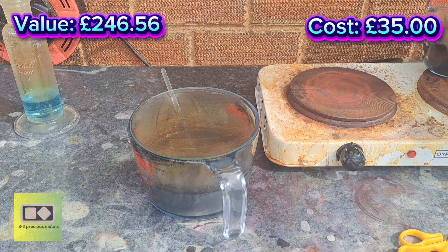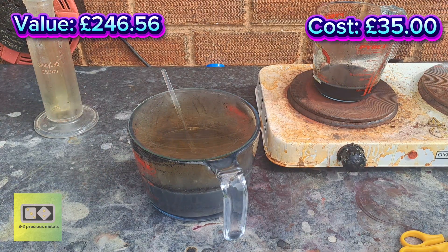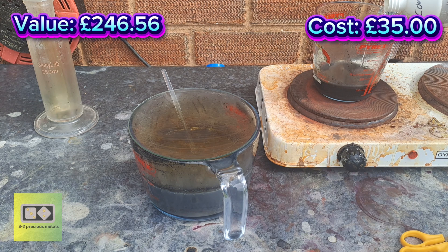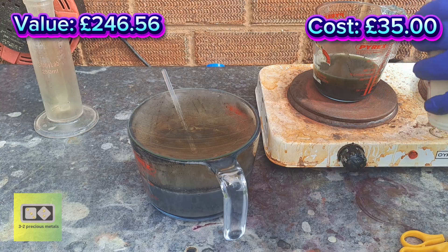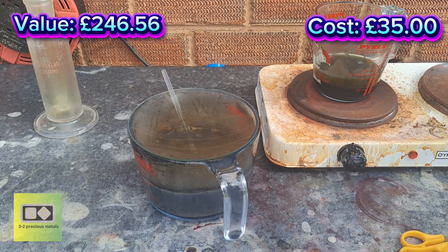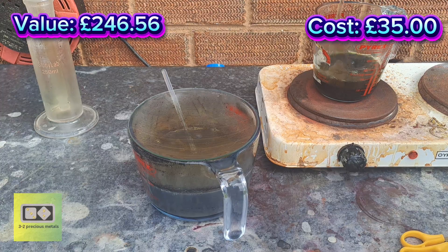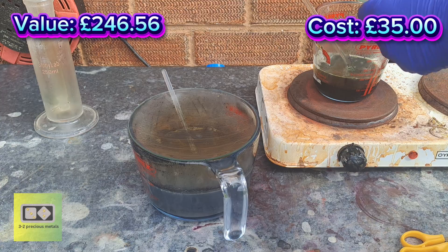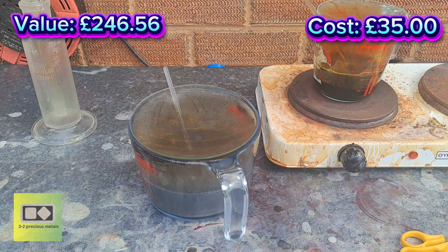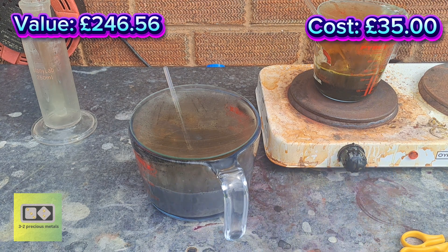There was a good amount of nitric acid in that pour I just did — as you can see the nitrogen dioxide is already starting to fill up underneath the water bath. Let's get some aqua regia in here — starting with about 100 ml of hydrochloric acid and then a heaped teaspoon of potassium nitrate. I'll leave that to react for about an hour maybe.